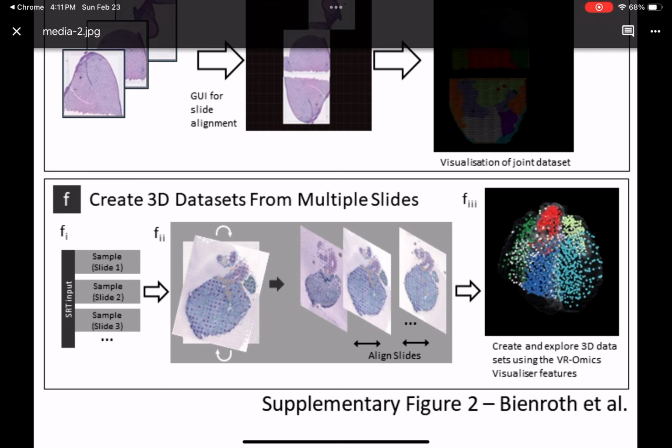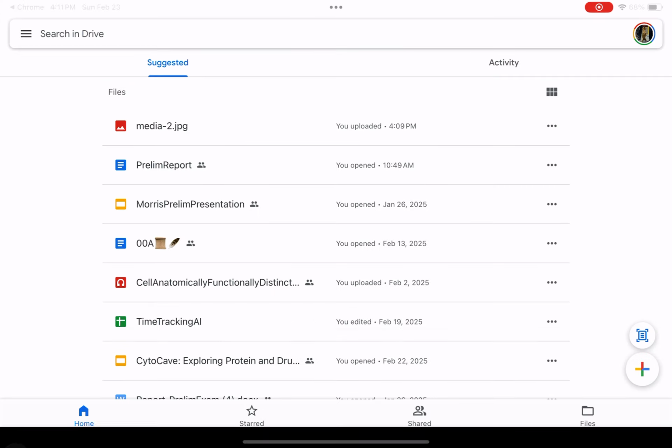22. An overlay of the 3D model provides the user a more intuitive understanding of which clusters correspond to anatomical structures within the heart, allowing for easier selection of biologically relevant regions of interest, ROIs, across the depth of the dataset. Supplementary Figure 4D. Processing patient samples and data analyses.